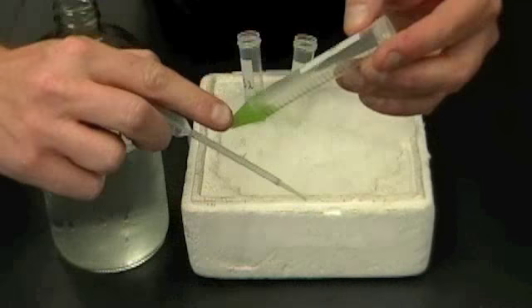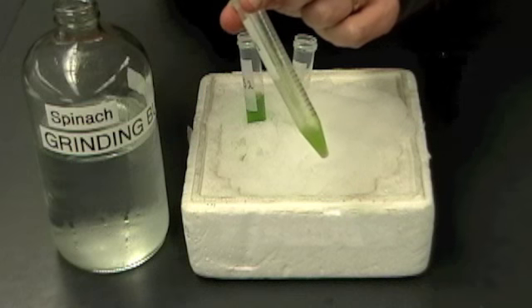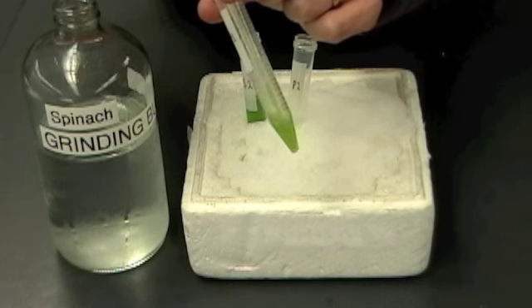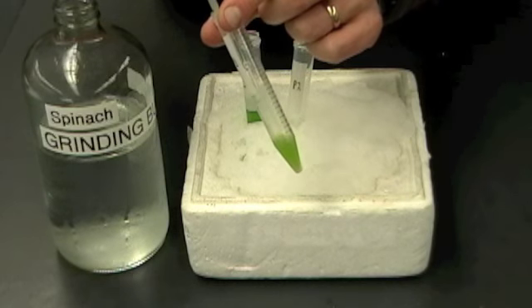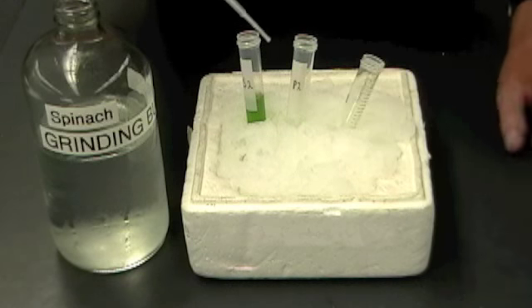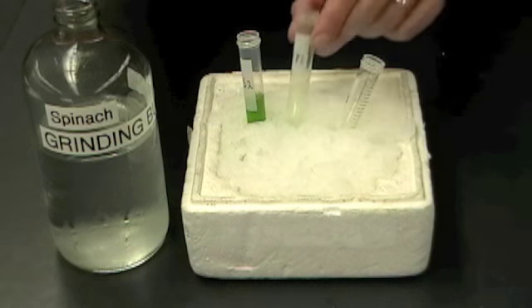Stop every now and then and check to see if I have any chunks, and if I still see some chunks, I'm going to keep squishing it till all those chunks are broken up. So really look carefully and take your time at this point, because it's going to make everything work better later on. Now once it's resuspended, I want to definitely put that right back on ice so I can protect any chloroplast that might be in there. Of course, you're going to do the same thing with pellet number 2.